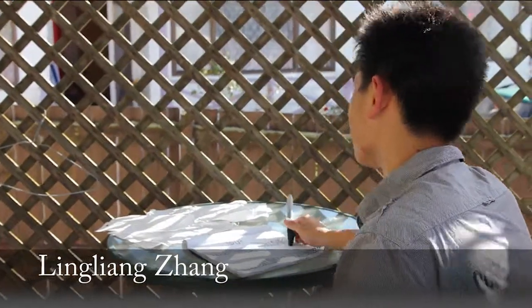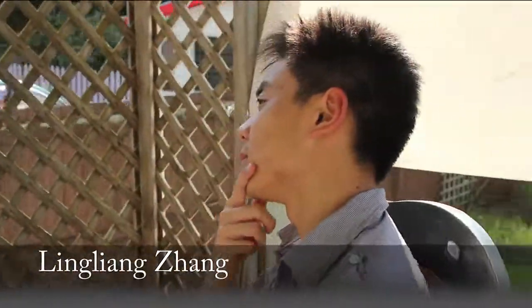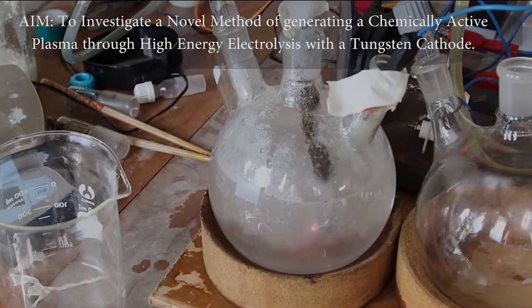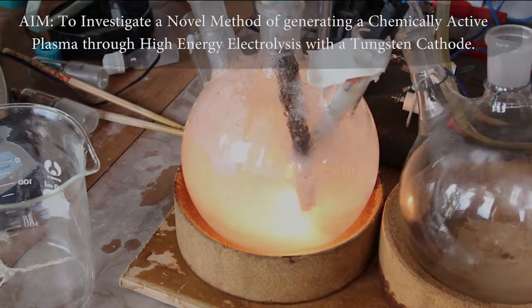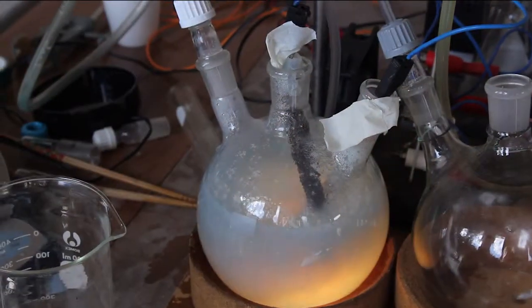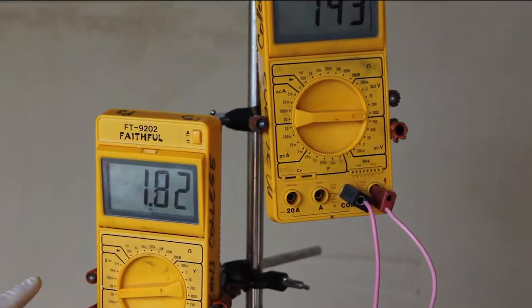My name is Lingliang Zhang, and I undertook Project ExoTungsten. Project ExoTungsten is the investigation of a novel method of generating a chemically active plasma through high-energy electrolysis with a tungsten cathode. This process seemed to unexplainably facilitate a variety of unknown chemical reactions.